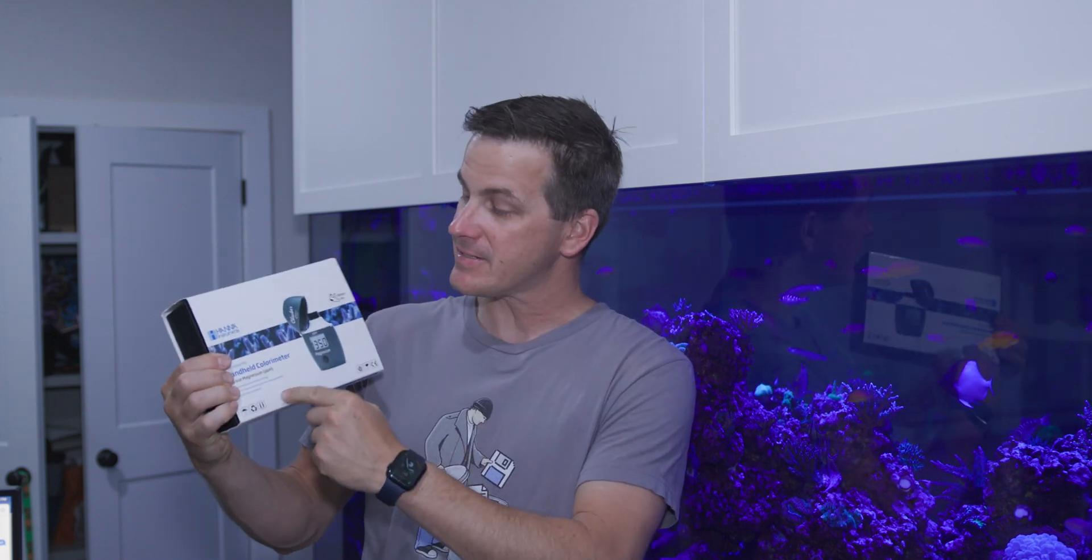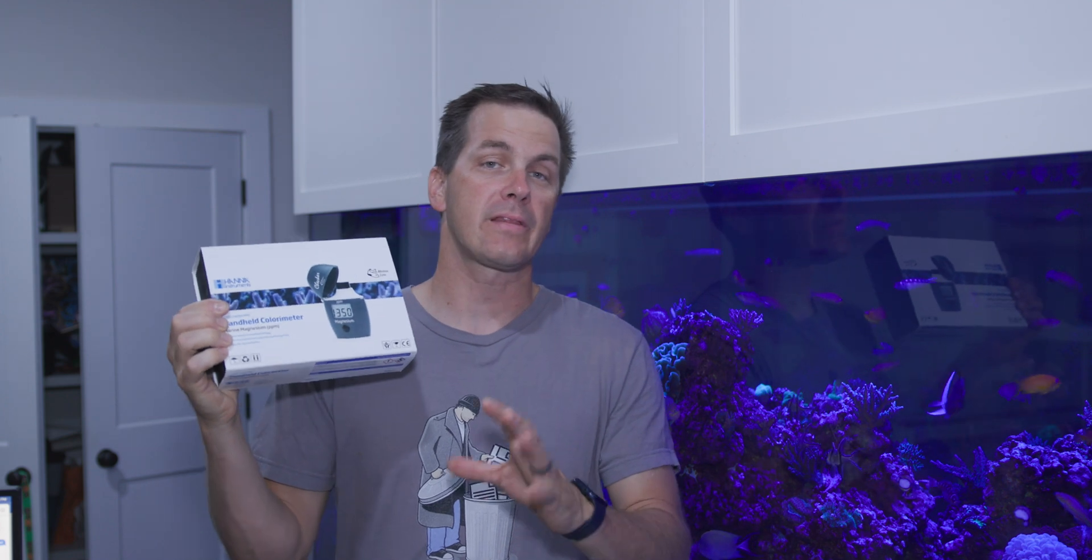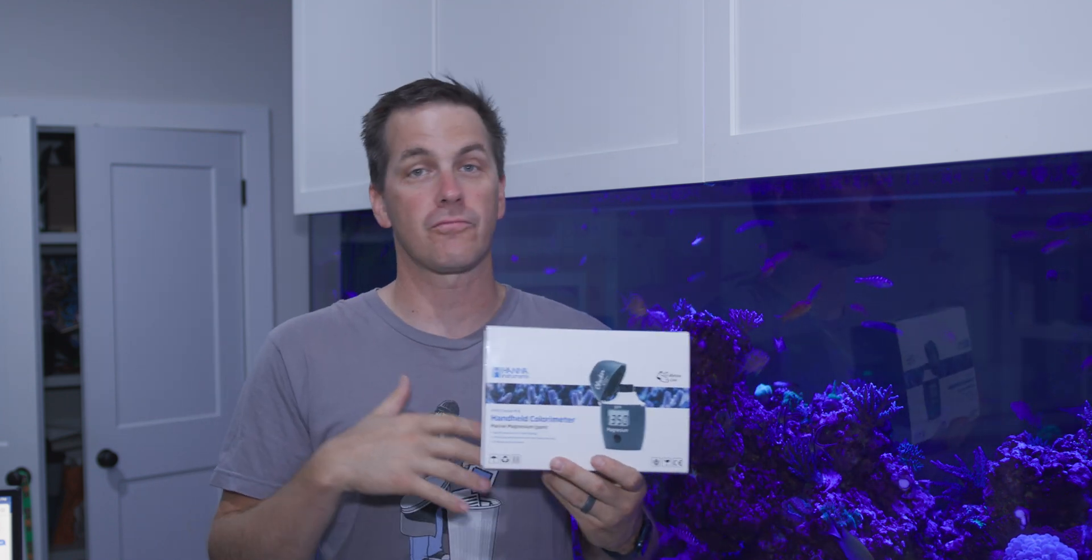Today, we're going to have a look at the much-anticipated Hanna Magnesium Checker, and I'm going to break this show up into two parts. First, I'm going to run a test on this thing and just run it blind and see how hard it is to use.